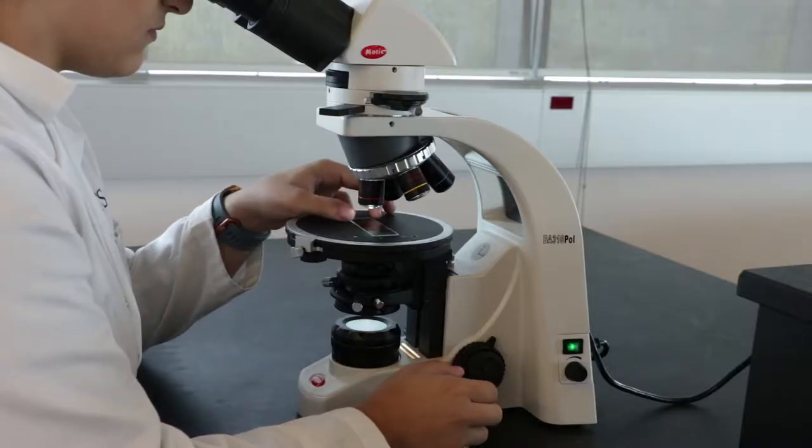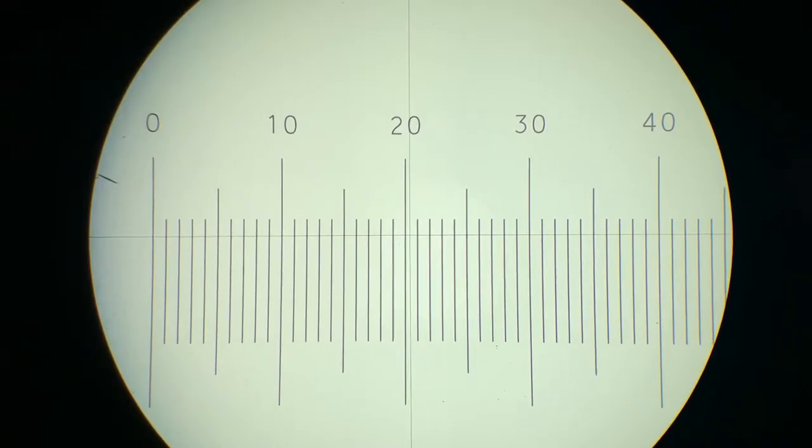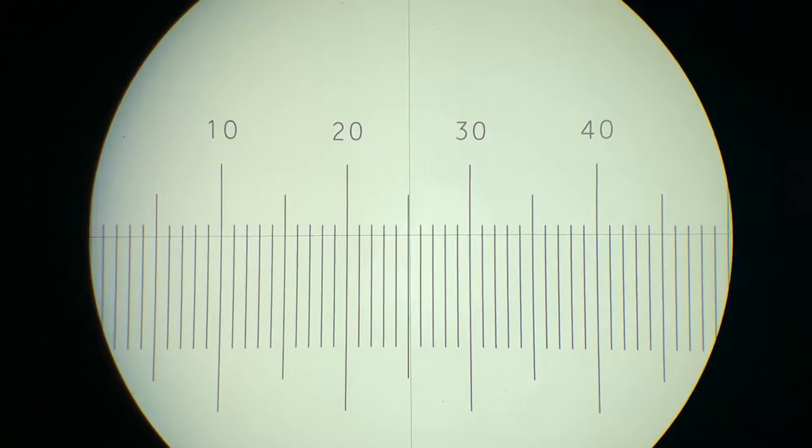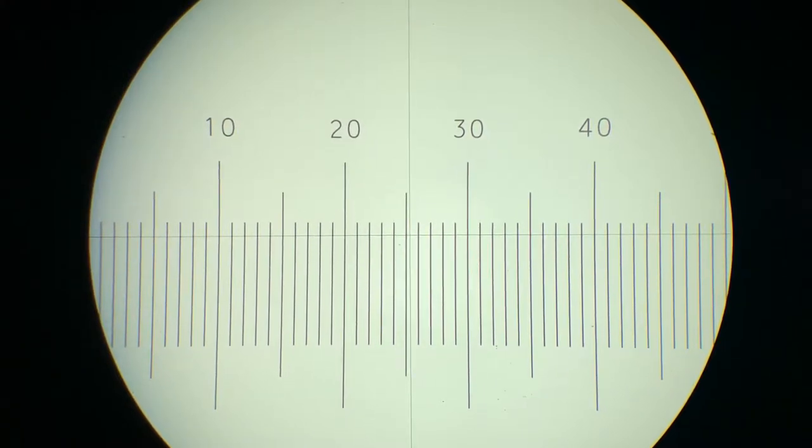Move the slide so that the zero bar is aligned with the left side of your field of view. Read off the bar on the right side of the view for your diameter. As you can see, for the 4x objective, the field of view has a diameter of 5mm or 5,000 micrometers. Write this down.